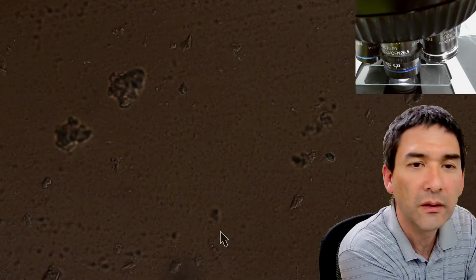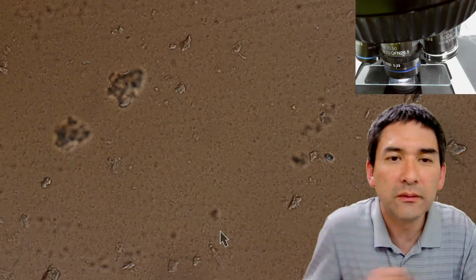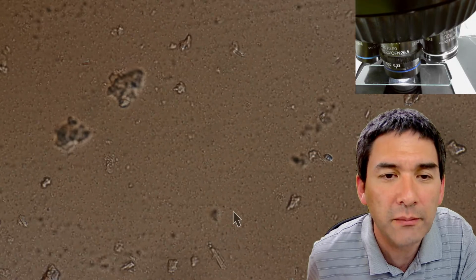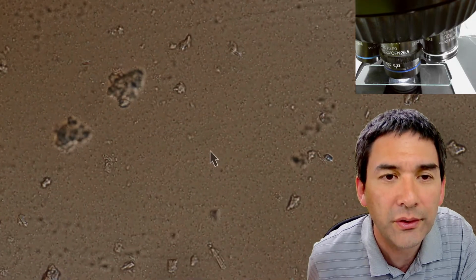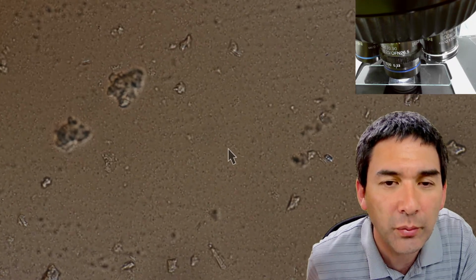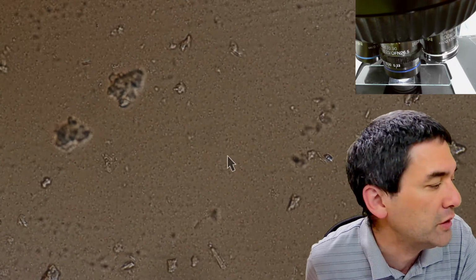I need a little more light. Yeah, so that's basically the powder directly, and you might be able to see those dots in the background. These must be the E. coli cells. And they're kind of wiggling around a little bit. I think this is due to Brownian motion.